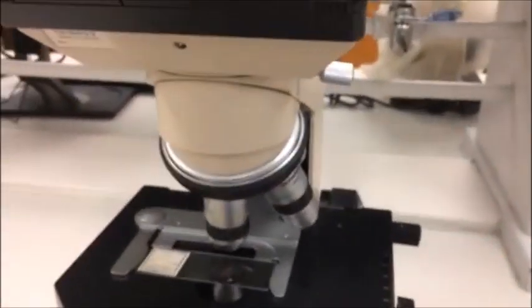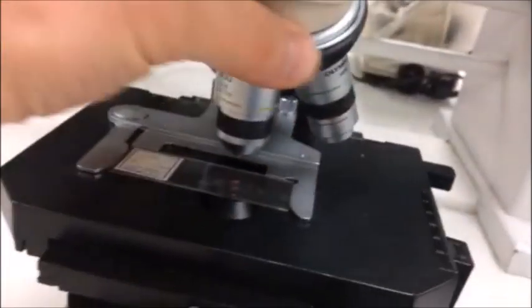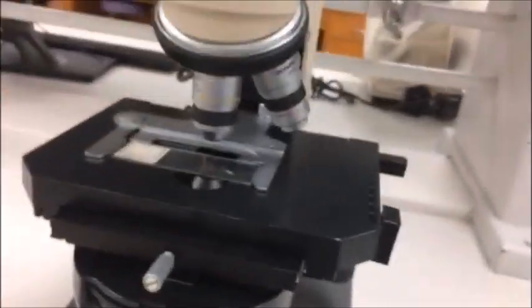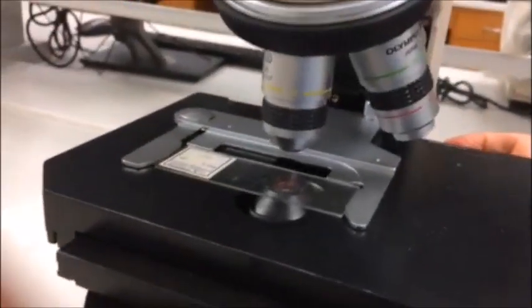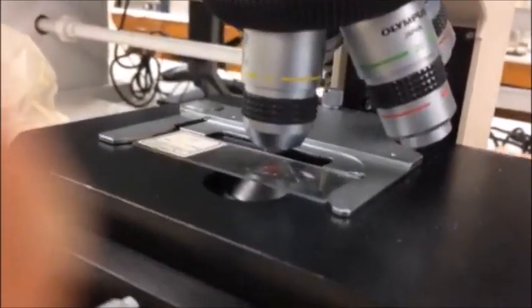So the initial setup of the microscope is to turn the light on, like I'm doing right here. Make sure that you're clicked in on 10x. Make sure that this is on zero. Crank the condenser all the way up. And then crank the stage of the microscope up until it's relatively close to the slide.